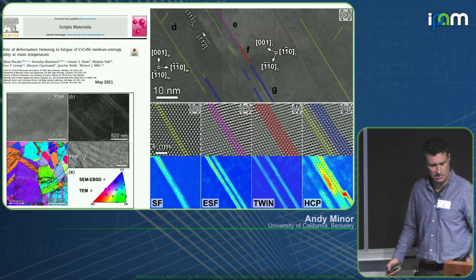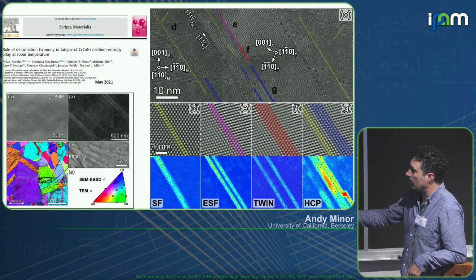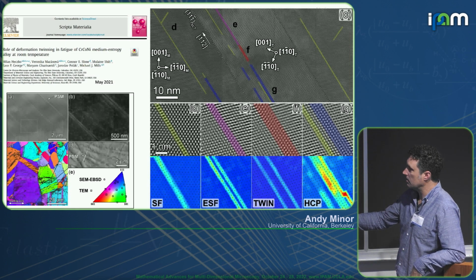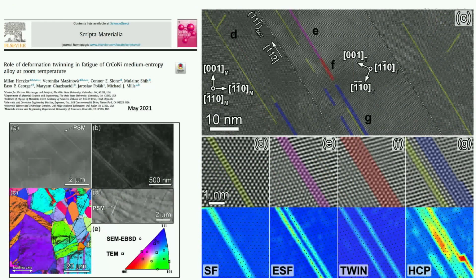And this is what's seen in the literature too, from ex situ experiments. This is the same exact alloy, ex situ fatigued, then looked at atomic resolution. This is a paper by Mike Mills' group at Ohio State, and it's the same thing. So he's now looking at ex situ the type of defect structures in this fatigued sample, and you see the same thing, these long extended defects that are essentially all the different variations of stacking you can have along the 1-1-1 direction.